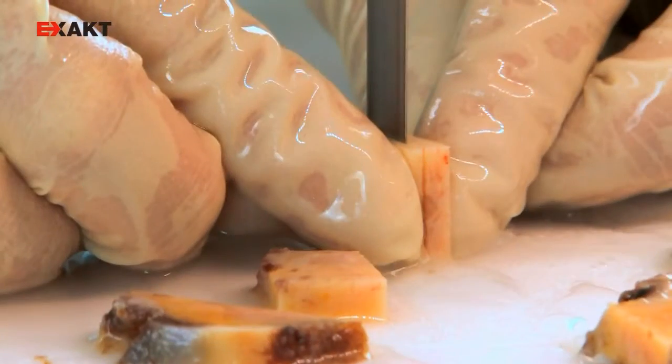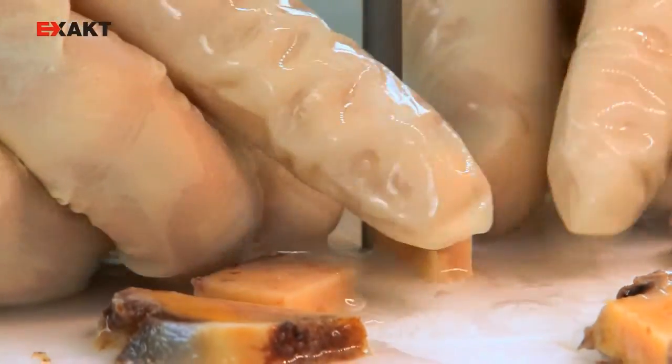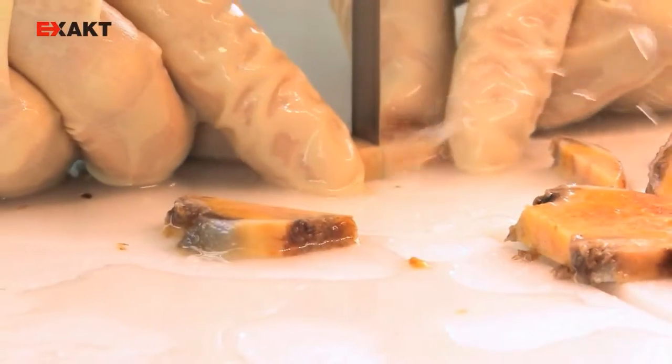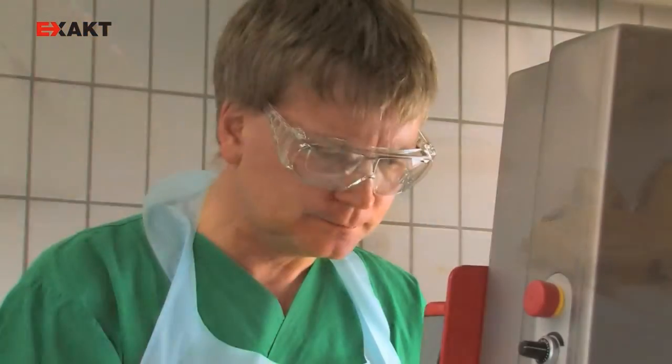Especially samples with screws or implants can be processed safely. Sometimes you are faced with implants that need to be processed — even these implants can be cut using the saw, which means it can be utilized in the areas of implantology, dental research, and anatomy.